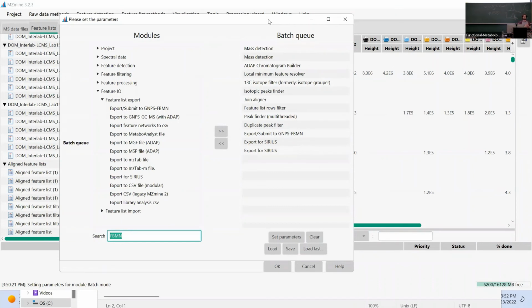But you can always sit together with your group, and maybe we can ask that every group at least gets one data set that ran with those parameters, and just get the files, because you only need 3 files that we're going to work on down the line, and they don't have to come from your laptop. So yeah.